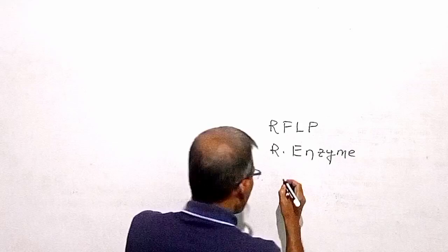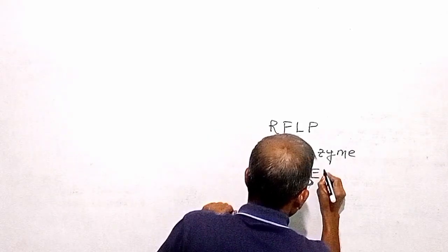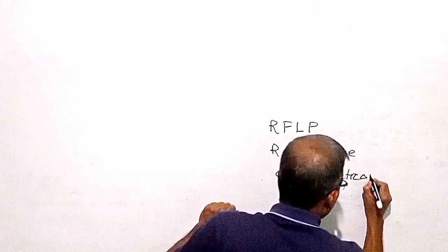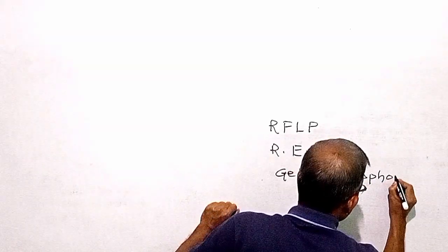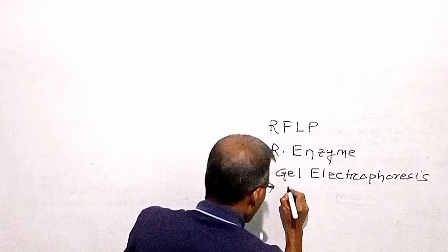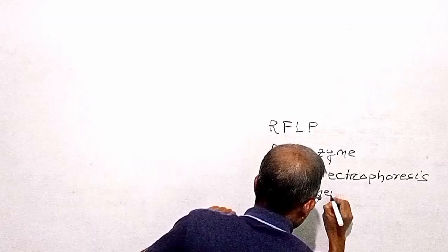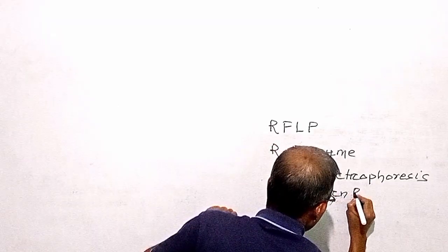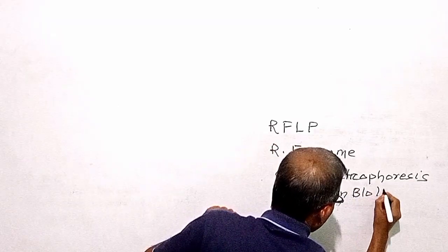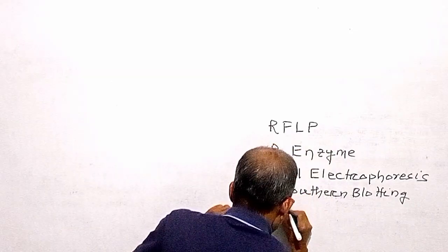This technique involves gel electrophoresis, particularly agarose gel electrophoresis, Southern blotting, and autoradiography.